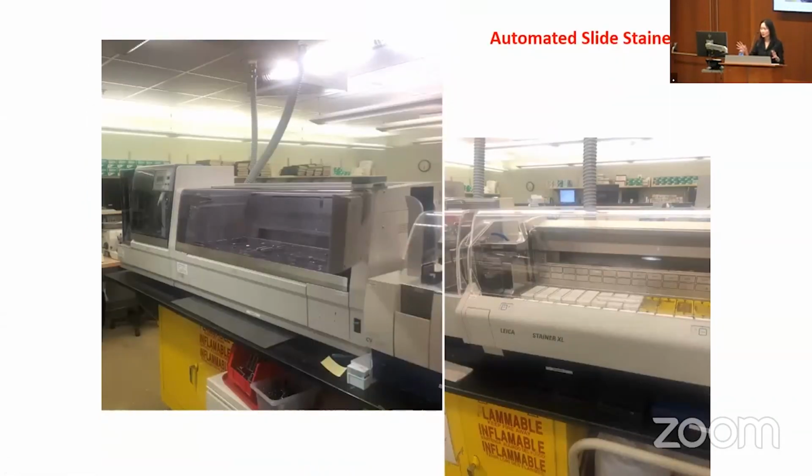Then this is the automated process. So you take all of these unstained slides that he's cut off the wax and load it onto this automated slide stainer. Takes about 40 minutes. It gets dipped into these bins that have dye in it. So one of them is hematoxylin and the other is eosin, and there's a lot of water and alcohol fixation in between. The automated slide stainer takes a batch of slides, dips them all sequentially into these bins for times that we've indicated for it. In about 40 minutes, you get unstained slides to stained slides. And this is how we get our actual slides. This arrives to us around 9 in the morning.